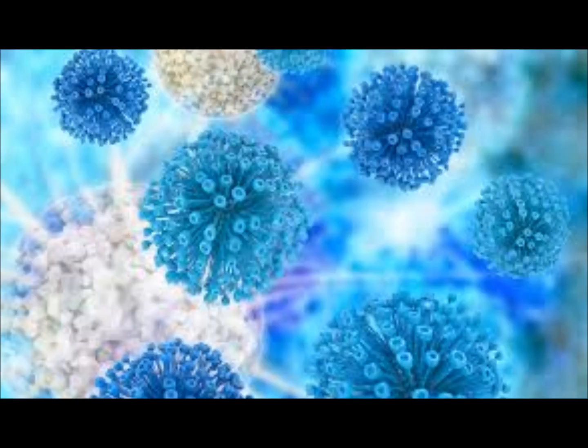So today, you'll be able to see your technique, because you did your plates. If you don't have individual colonies by your third quadrant, that tells you either you didn't change loops or you went too many times into the previous set of streaks. Try to only go once or twice. Okay? And today that'll tell you. You'll get to see your work. And your goal is to have individual colonies by the third quadrant.